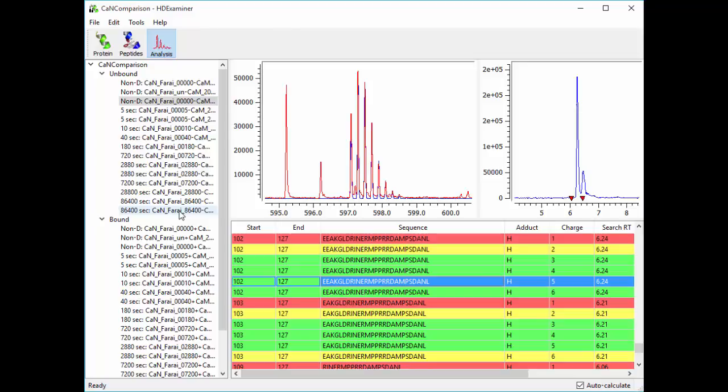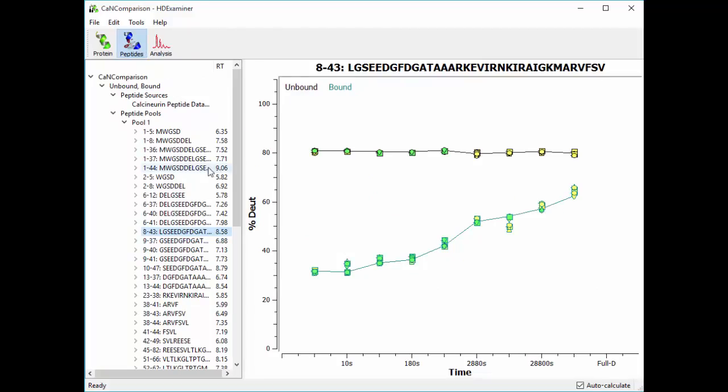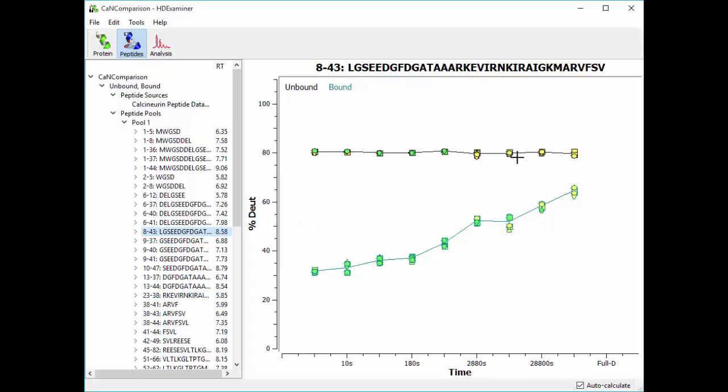Once everything is analyzed, the next step is to go back to the peptides view and look at the uptake curves for each of your peptides. So in this case, the uptake plot shows two curves. The black curve is the unbound protein state, and the blue curve is the bound protein state. Each of these shapes represents a single result as calculated back in the analysis view. These shapes are color-coded by confidence. Green means high confidence. Yellow means medium confidence. Low confidence results are not shown in any downstream calculations.